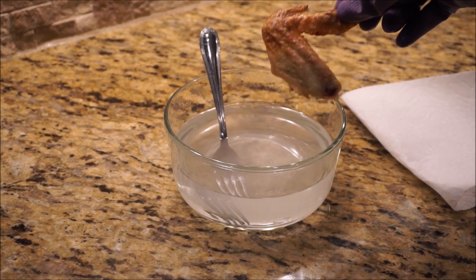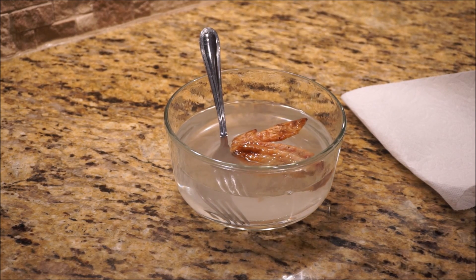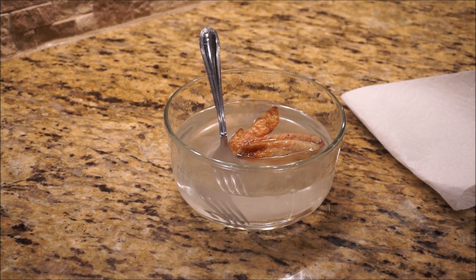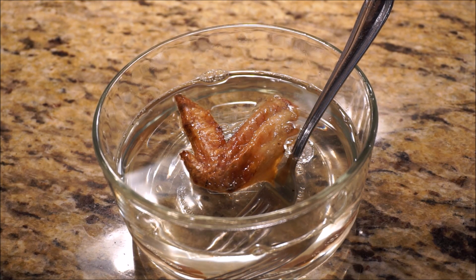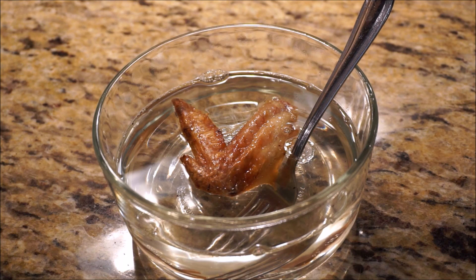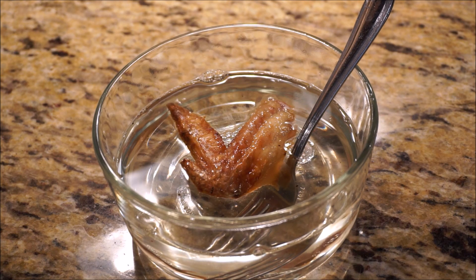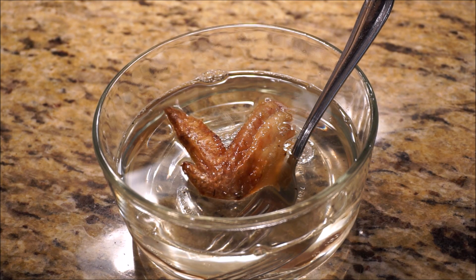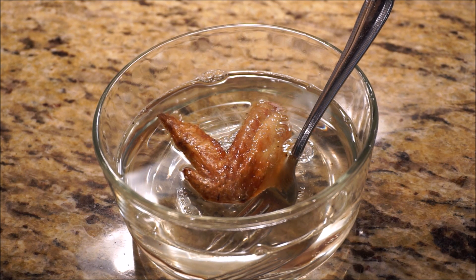We're now ready for our piece of chicken — here's our chicken leg. What's going to happen here is the potassium hydroxide is essentially going to turn all of the cells and cell walls in the chicken leg into soap, pretty much. And that's what it would do to your skin too — take all the fats lining the cell walls and make them into soap molecules.